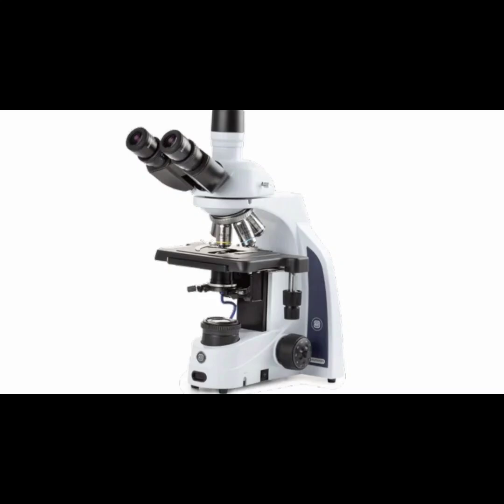Here also a special type of condenser system is placed. You can notice the wired system of the condenser, which is connected to the diaphragm. So this is the difference between dark field microscope and light microscope. Okay.